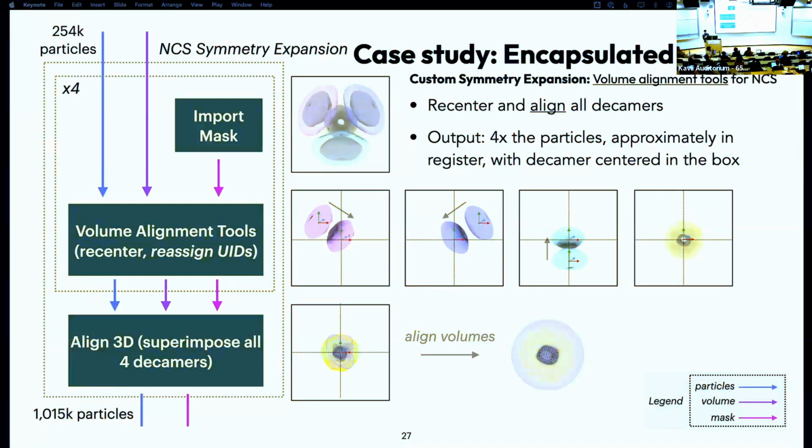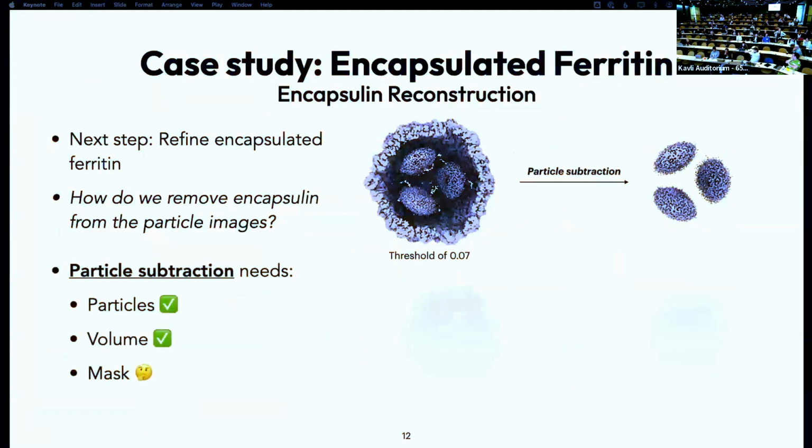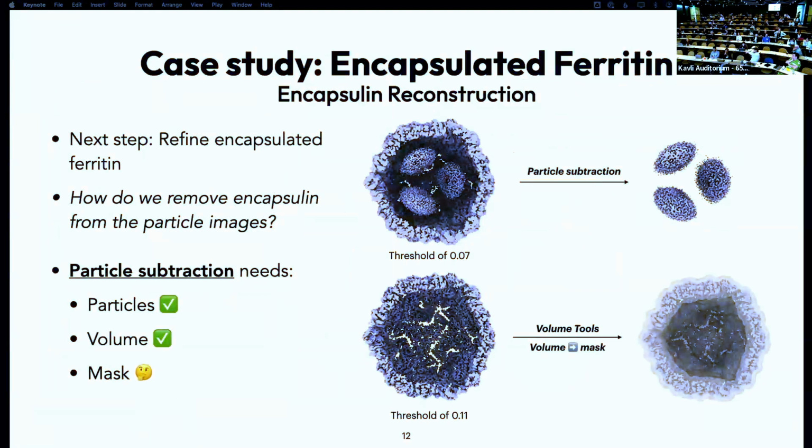I think just to add to that, another way to say what Michael just said is that the prior is actually very strong. We are very strongly assuming that each of those 4 pieces of cargo are strongly related in their pose to where they are in the shell, because those poses that initially came from aligning the shell, like the poses from the very first reconstruction on the top right there, are maintained throughout, except for small changes, like aligning the tetrahedron to itself in different classes and then doing local refinements after that.